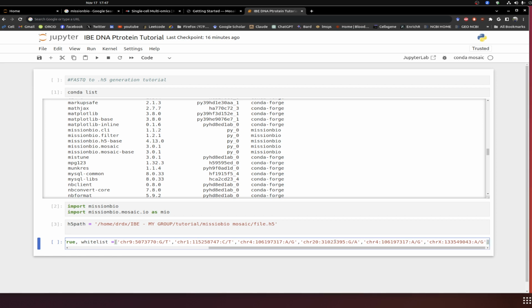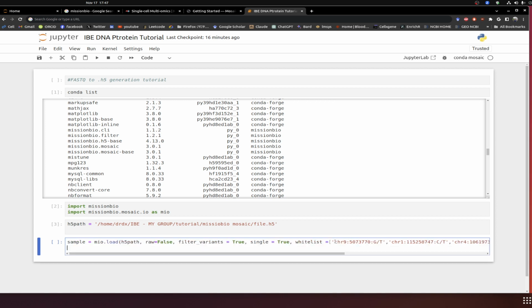Now what did we have? We have these. So we need to end it with, now you want our sample.